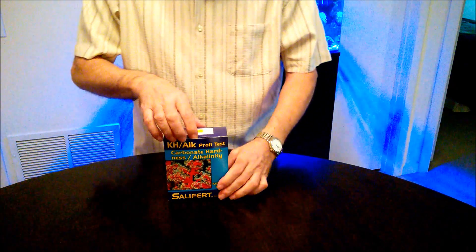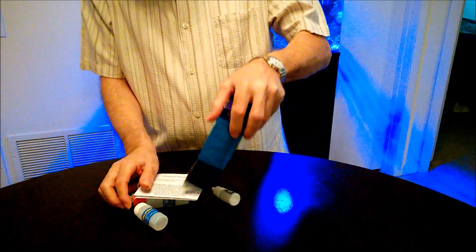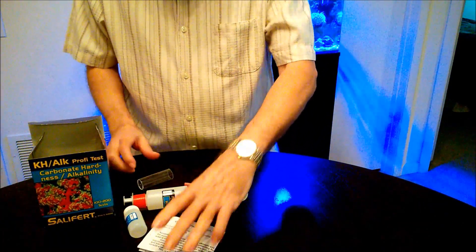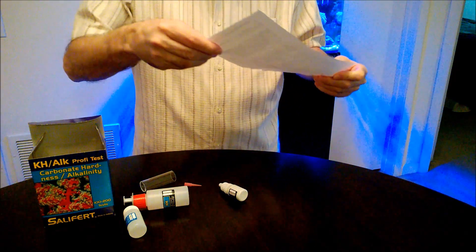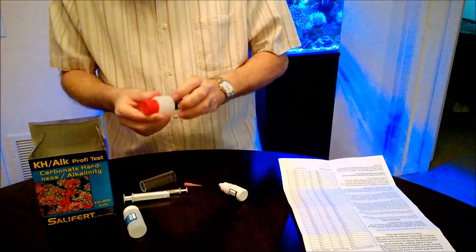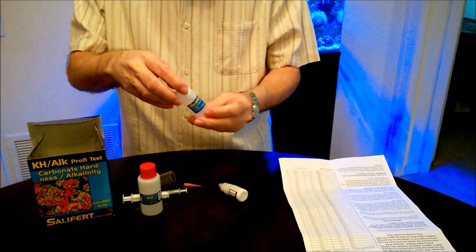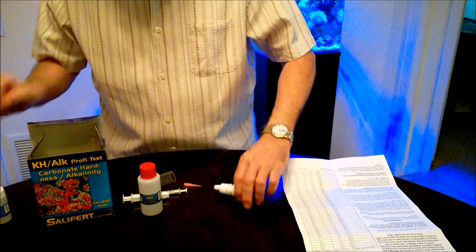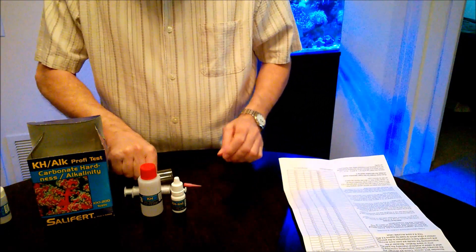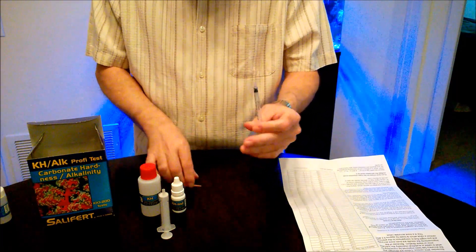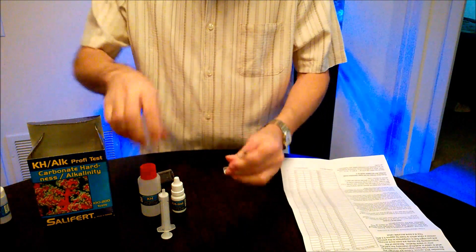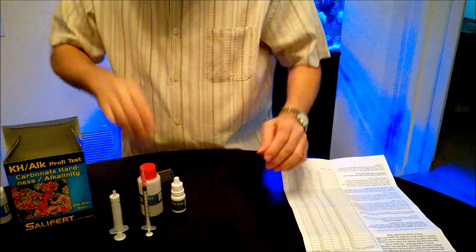So here it is by Salifert. Let's open it up and see what it contains inside. Of course, here we have the instructions, and then we have the KH calibrator. We really don't use it. And then you have the KH-IND indicator. And of course, the 5ml syringe and the 1ml syringe. I'm going to go ahead and add the adapter right now as we speak. And of course, this is the vial.